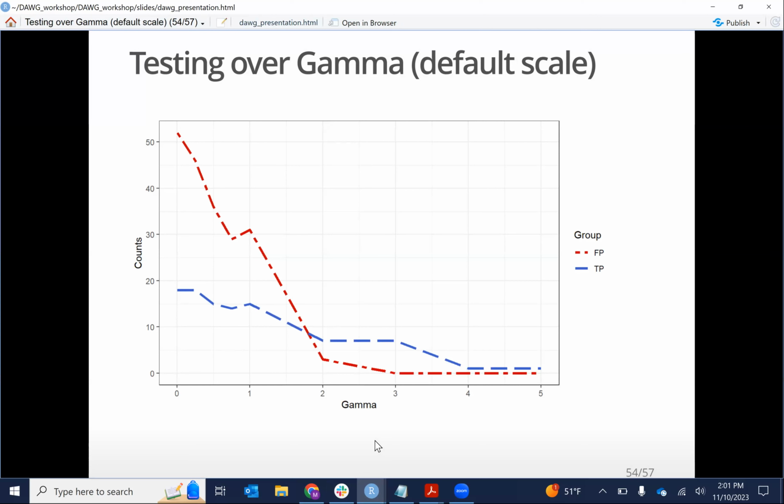But especially for the smaller levels of gamma, you have nothing to lose by incorporating some scale uncertainty in this example. We'd also argue that something like this could be useful depending on what the goal of your experiment is. If your goal is just to identify potential variants that you would want to study more and want to spend your research dollars on, obviously the best place to start is probably those that are still significant when there's super high amounts of scale uncertainty added, as candidates.